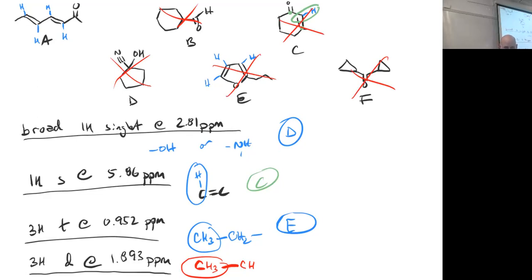So this was a CH3. What it's next to is actually a carbon-containing functional group. And I like that this is actually where that peak shows up in this molecule. So this is a CH3 next to a CH, but this is a little bit lower than we would expect. We would expect this CH3 to be 2 to 2.5, but it's actually like 1.9, which is pretty close to 2, but it is a little lower than we would expect.